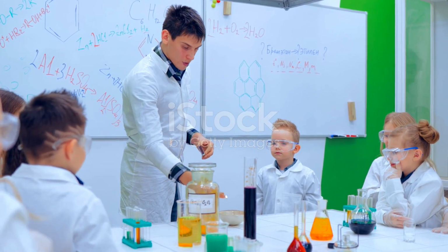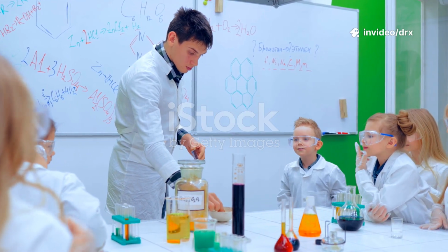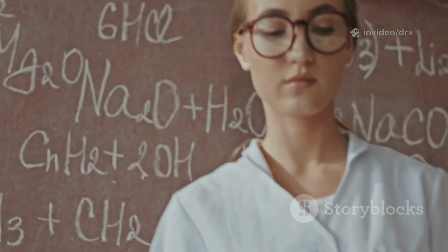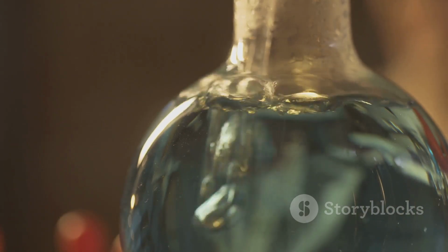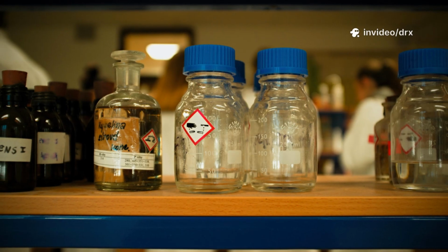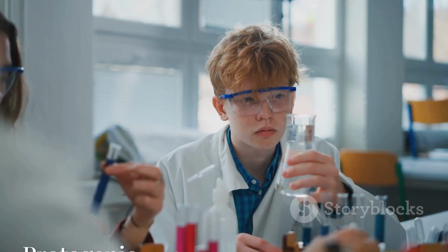Alright, so let's talk about the classification of non-aqueous solvents, starting with protophilic solvents, which are also known as basic solvents. These are the ones that actually accept protons, or hydrogen ions, H+. Some common examples include pyridine, liquid ammonia, and ethylamine. And these solvents are typically used to titrate weak acids.